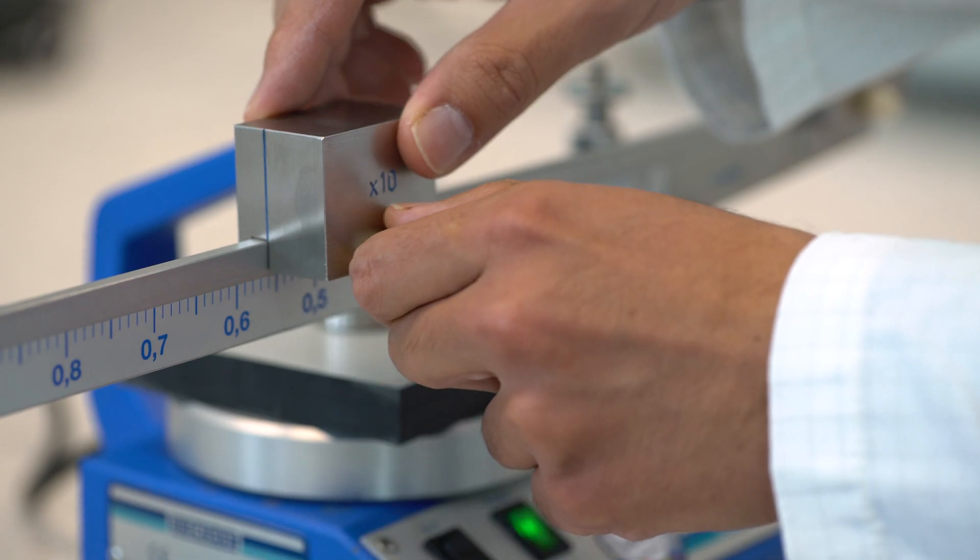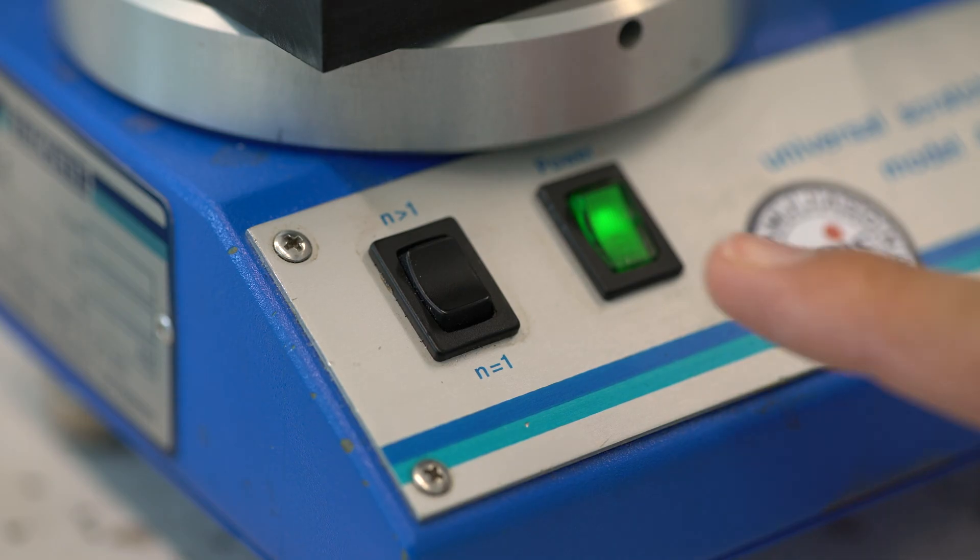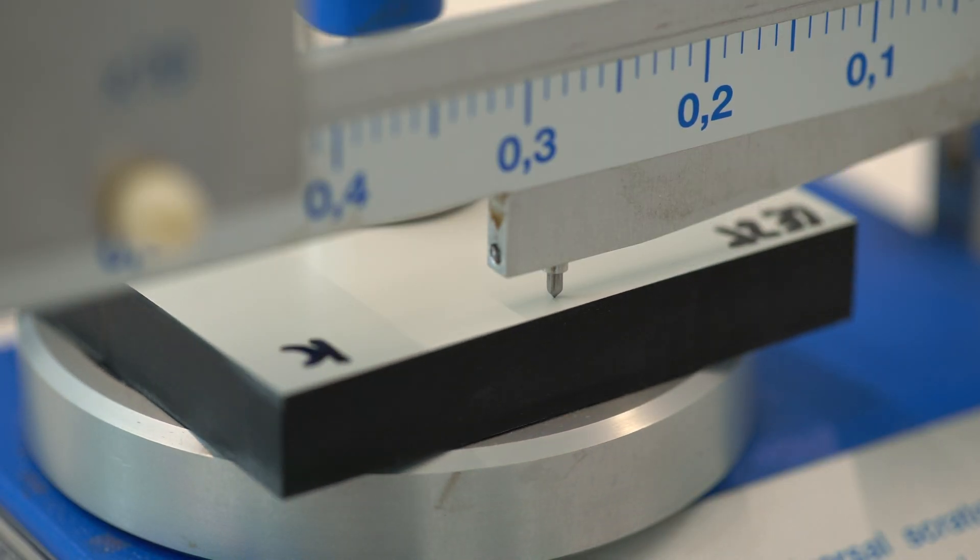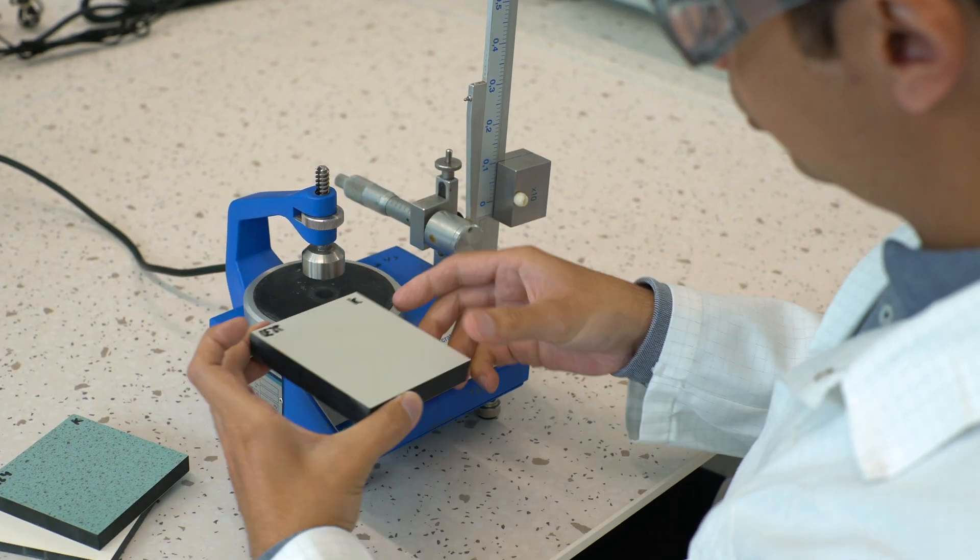Resistance to scratching is an important test to characterize the quality of the surface finish in TopLab products. During testing a diamond tip needle is used to apply an incrementally increasing load on the surface of a sample.